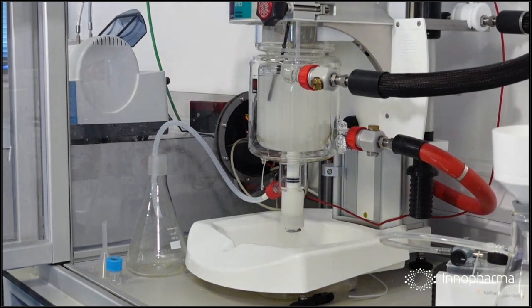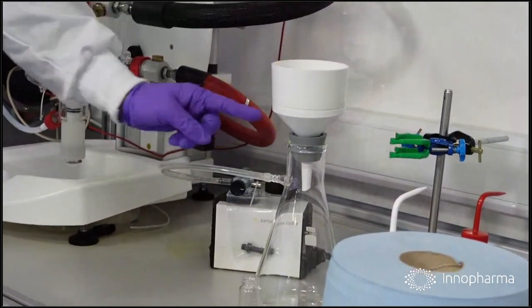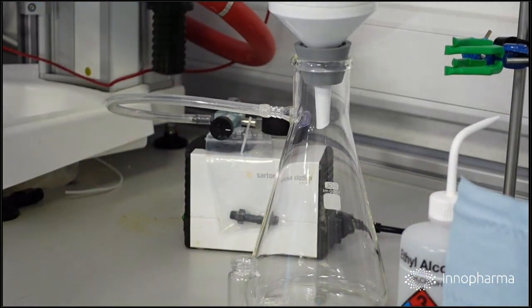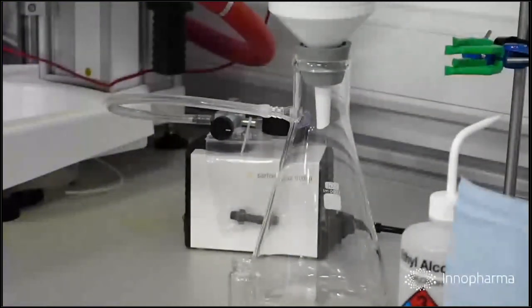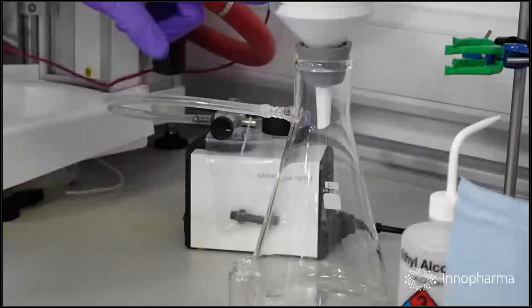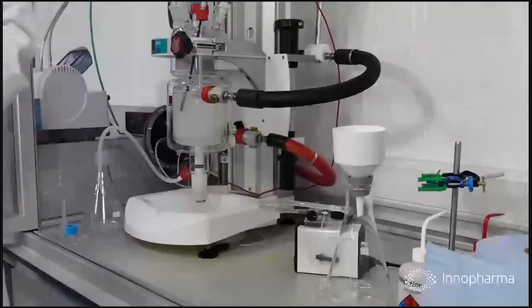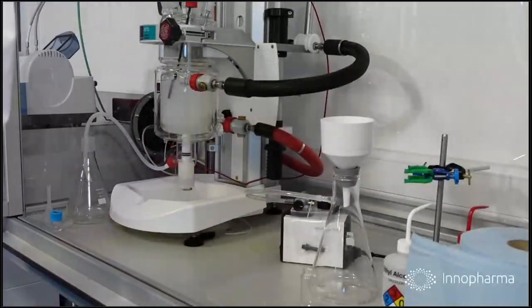So, pouring the solution into a filtration funnel with filtration paper in it. The solution is going to be drawn into the vessel below using a vacuum pump. Perhaps you can see it more clearly now. Okay, yeah, I can see it on the live stream. So yes, the solution with the crystals in it is going to be poured into the filtration funnel with filtration paper inside. The solvent is going to be drawn down into the bottle, trapping the crystals in the filter paper. Yes, and the vacuum pump is off to one side. And as long as we don't allow so much solution in that it gets up here, we'll keep our vacuum pump running.